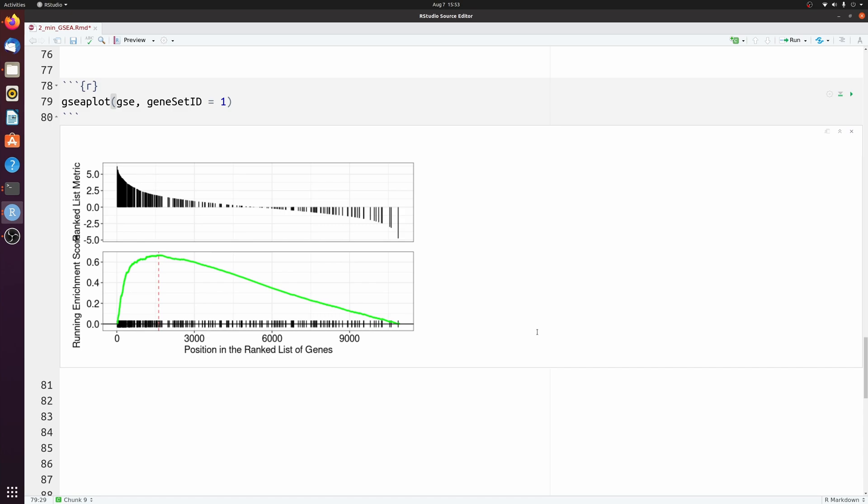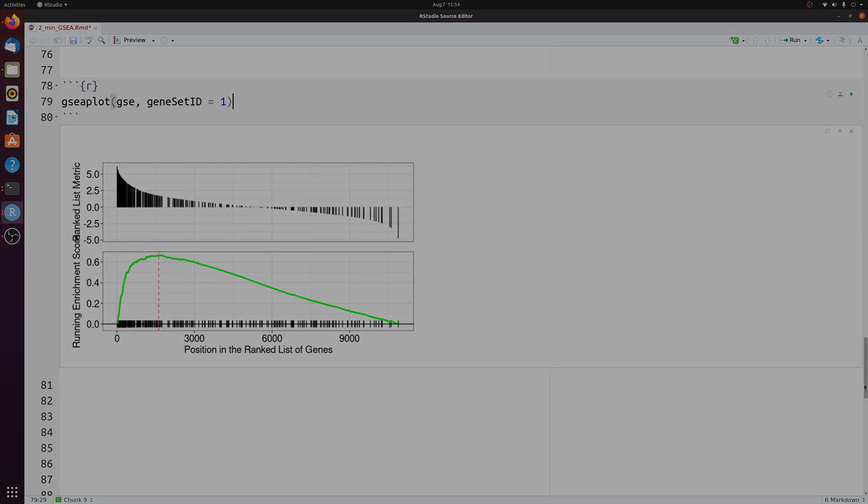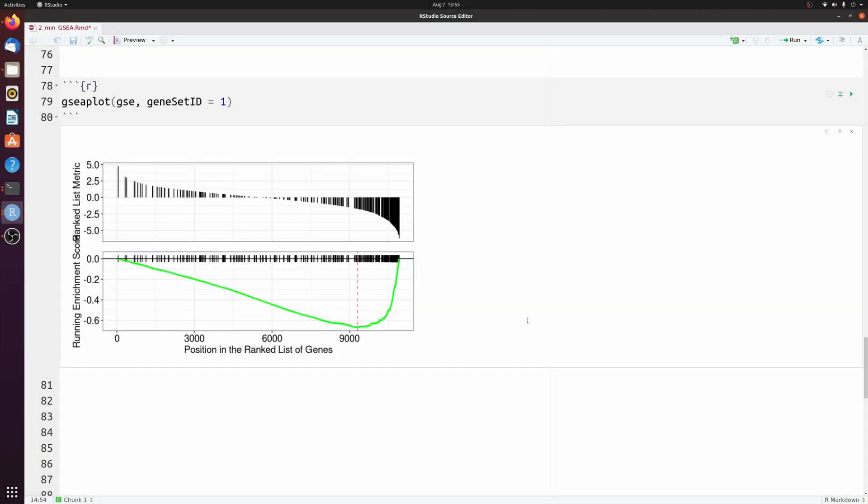And then just for example's sake, let me show you the same term, but I'm going to flip the comparison and the differential expression so that it shows up as negative. So here's what you would expect to see if the downregulated genes were enriched for this gene term.